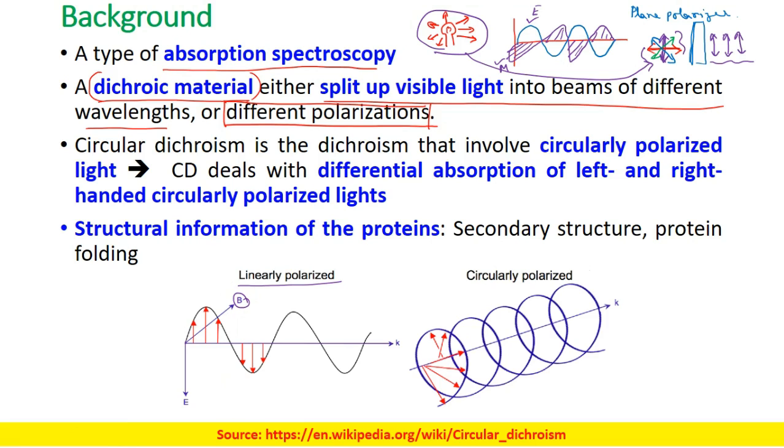The reason being, usually the electrical field of a wave is quite high compared to the magnetic field, so we can neglect the magnetic field. So the light waves which are moving in only one plane are regarded as plane polarized light or linearly polarized light.